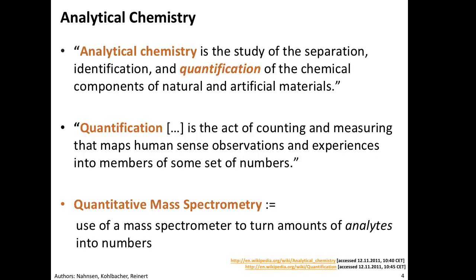So let's start with talking a bit about analytical chemistry. That is fundamentally the study of separation, identification, and quantification of the chemical components of natural and artificial materials. That is so far so easy. And quantification is defined as the act of counting and measuring.